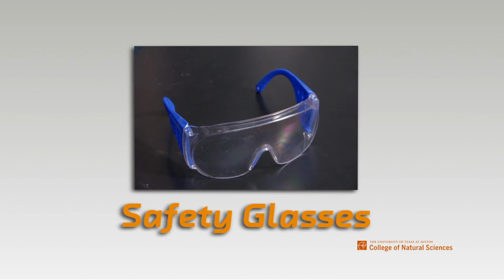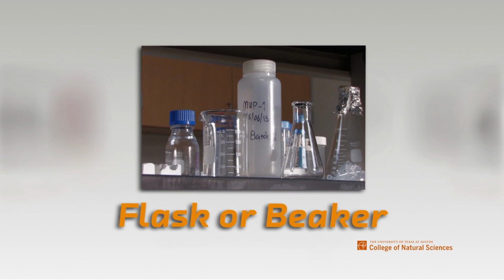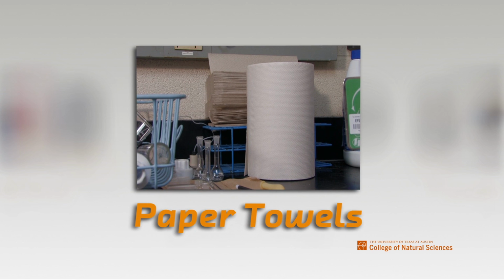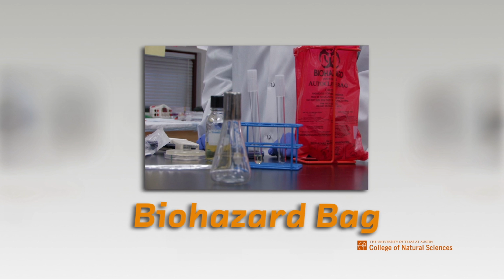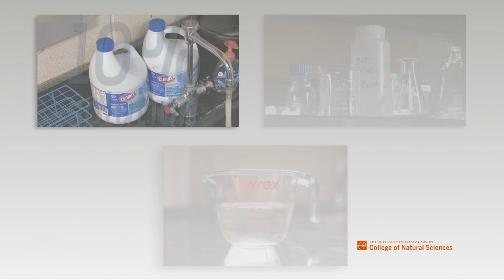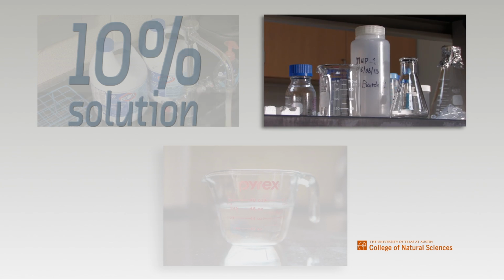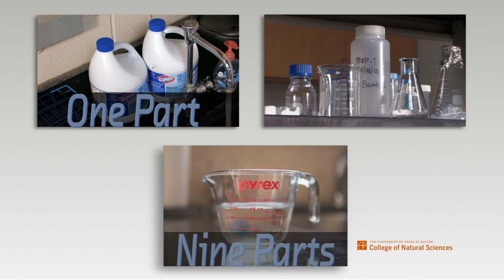Now, let's discuss what you would do to clean up a small biological spill. First, gather the necessary equipment: safety glasses, gloves, a lab coat, disinfectant, a flask or beaker, absorbent paper towels, and a biohazard bag. If using bleach for your disinfectant, prepare a 10% bleach solution in a flask or beaker. This solution is 1 part bleach to 9 parts water.